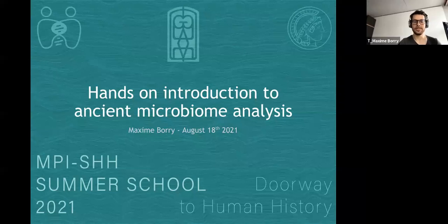All right, thanks for the introduction. So yeah, I'm going to tell you a bit today about ancient microbiome analysis. And we'll do this with the first few slides to introduce the theory behind it. And then we'll have a practical that will last a bit longer for the rest of the session.